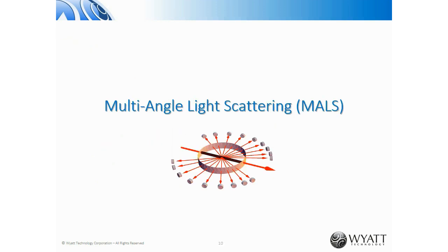Let me start with multi-angle light scattering. It is the technique that measures the intensity of scattered light simultaneously at multiple angles. The scheme of the instrument is shown here: incident laser light, and the flow cell is surrounded by an array of photodiodes that measures the intensity at different angles.